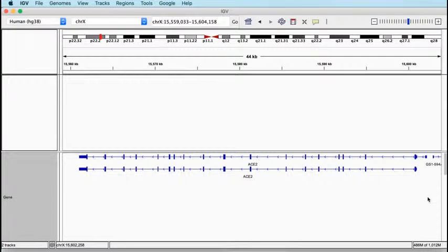If you wanted to load in some of the kinds of annotation that we were seeing in the tracks in the UCSC genome browser, we could absolutely do that, and load that data into view in this genome browser as well. But as I said, the versatility of this particular application is really in its ability to load in data that you have locally.